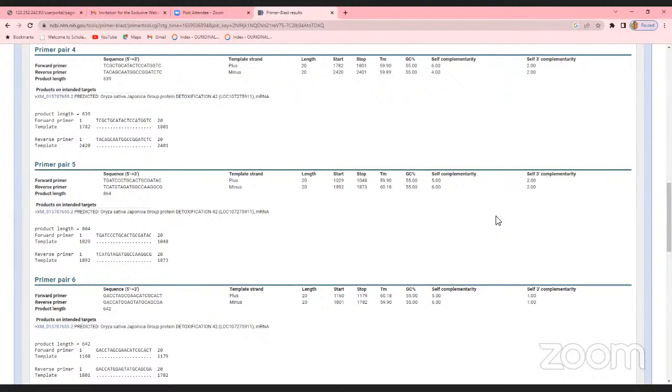This score shows whether there is any chance that the primer will bind to itself and to other primers just at the 3' end. If the 3' end is filled by making a primer dimer or a hairpin loop at just the 3' end, it will create another problem.